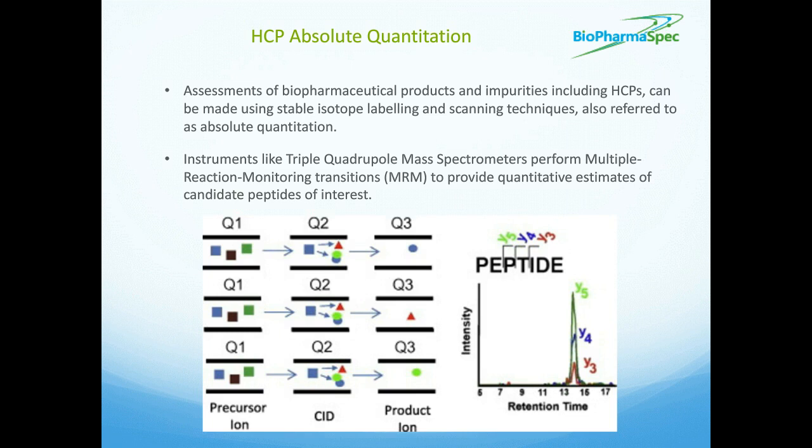So firstly, the instrument selects precursor ions belonging to the peptide of interest that are from a predetermined list that we input into the method. This takes place in mass filter quadrupole 1. Fragmentation of the precursor ion is then induced in the Q2 collision cell, generating the resultant product ions in the third quadrupole, Q3. Each Q1 to Q3 transition from precursor to product ion constitutes a single reaction monitoring event, and what we want to do is select strong transitions for the best sensitivity.